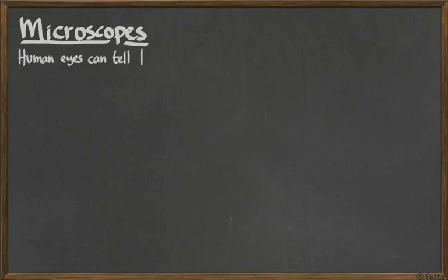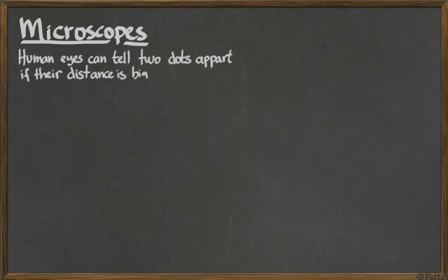This is a short class because microscopes are best learned by putting your hands on and playing with actual microscopes. Okay, so what are these microscopes and what do we need them for?